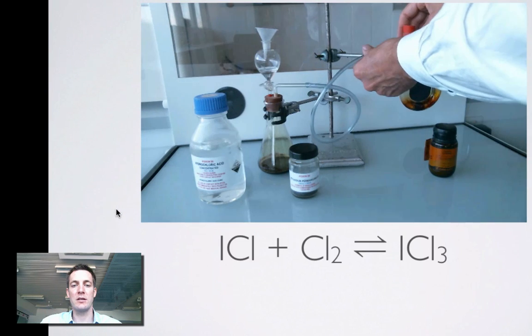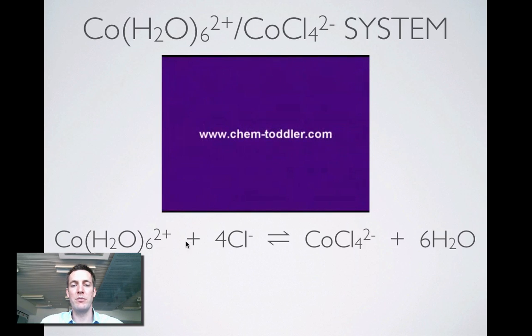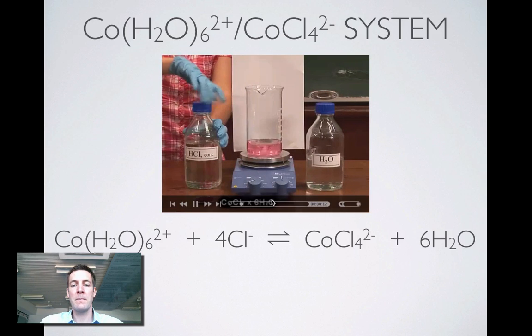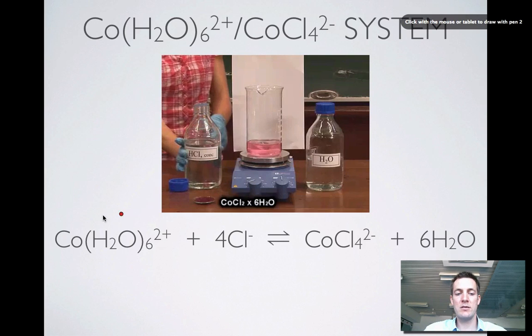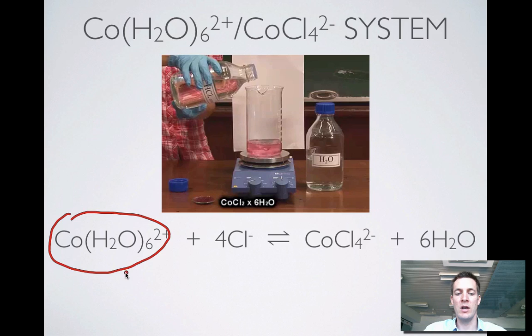I think there's a little bit of this film left but we can move on to the next reaction. This reaction involves a cobalt equilibrium with two different colored species that we can observe. It's quite nice because we've got two different colors. We can see what they are. Here we've got the pink. This beaker in here has got the pink hexa aqua cobalt 2 ion.